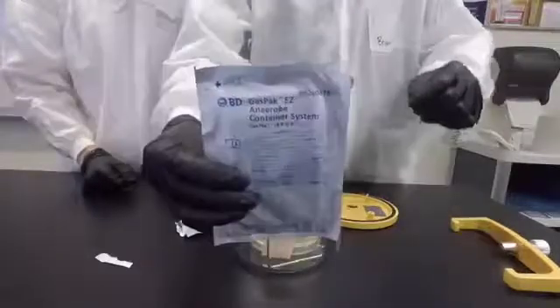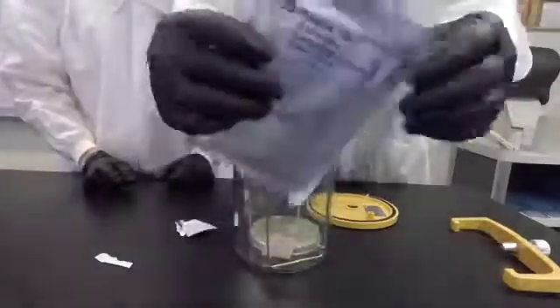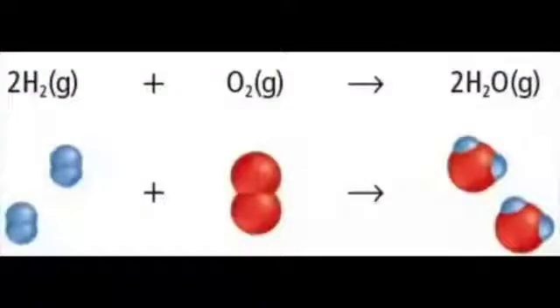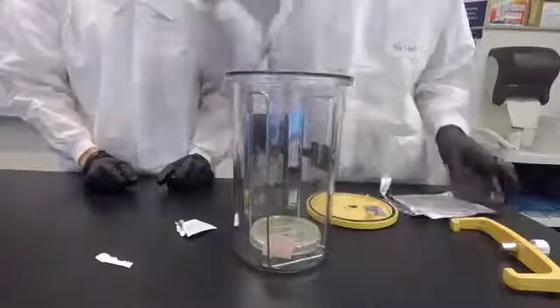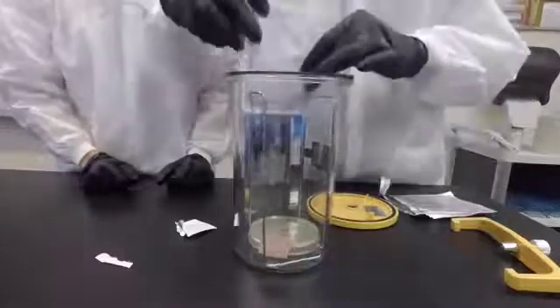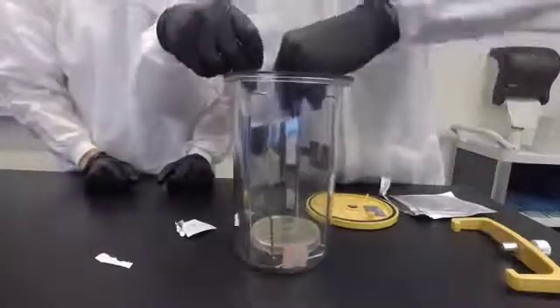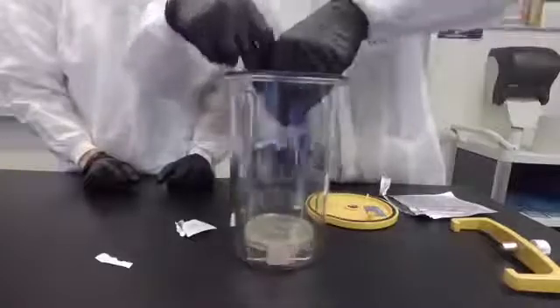And the last thing we will add is the chemical gas generator pack. This pack becomes activated once removed from the foil pouch and placed inside the jar. As mentioned earlier, this chemical gas generator contains sodium borohydride and sodium bicarbonate, which will convert four atoms of hydrogen and two atoms of oxygen into two molecules of H2O. You'll be able to observe this water condense on the inside wall of the jar.